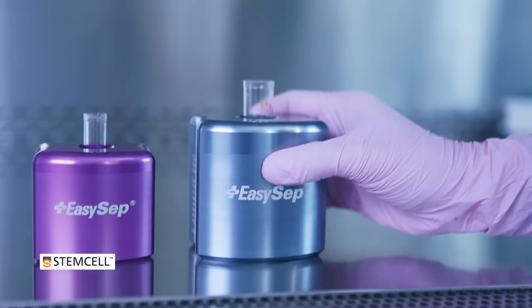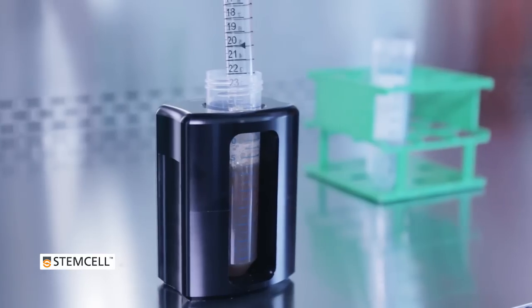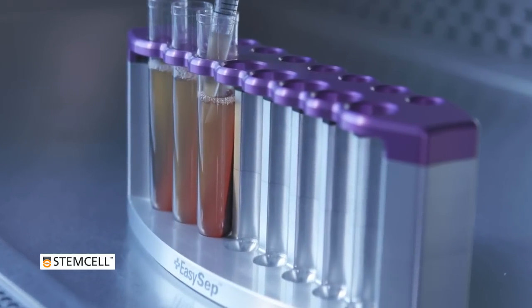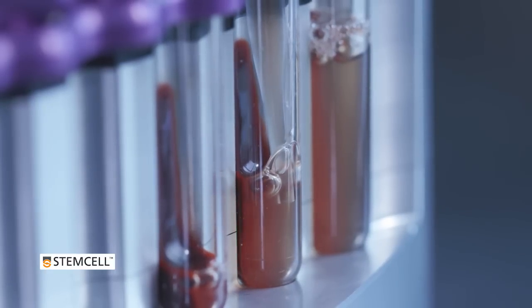EasySep Direct is compatible with a range of magnets, allowing you to process samples ranging from half a mil to 30 mils in volume. Combining EasySep Direct with the new EZ8s magnet allows you to process up to 8 samples per side simultaneously for fast, high-throughput cell isolation.